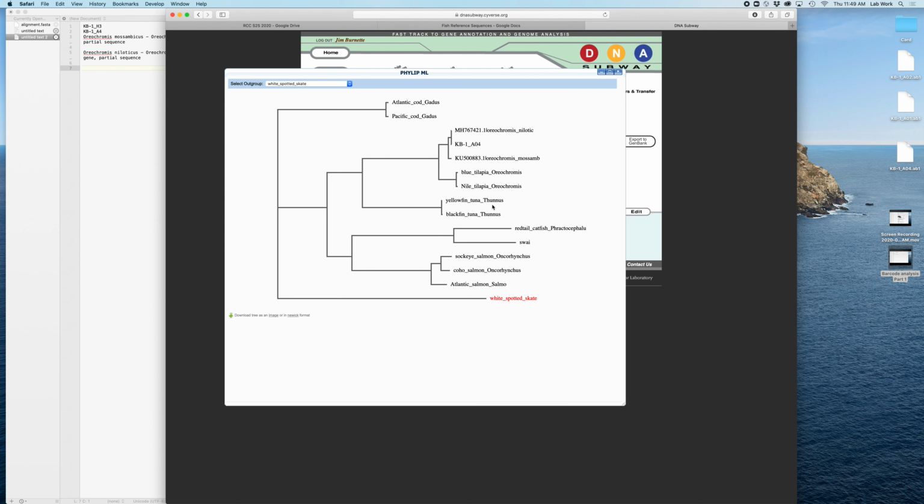So it looks like we have identified a tilapia. We're going to now go look and see specifically. Again, from our BLAST analysis, there were a couple of differences from this one to this one. This shows that these are identical, because this little branch right there means that it has some sequence differences.